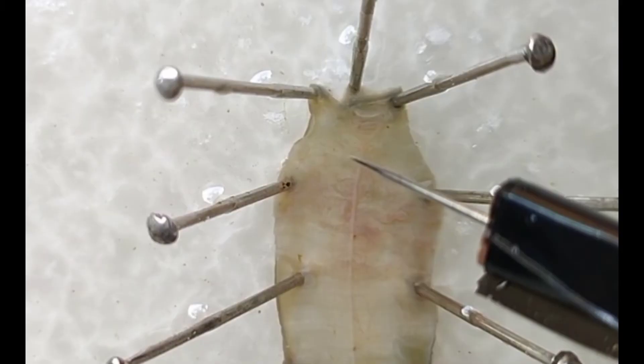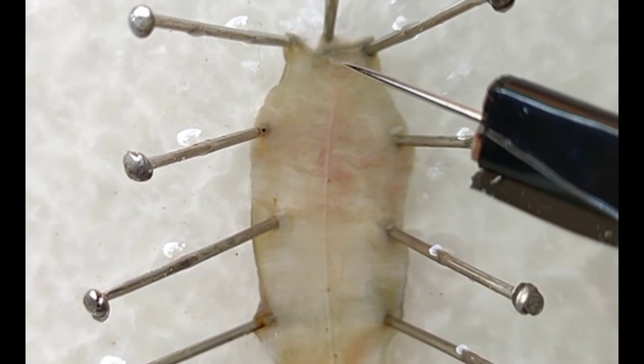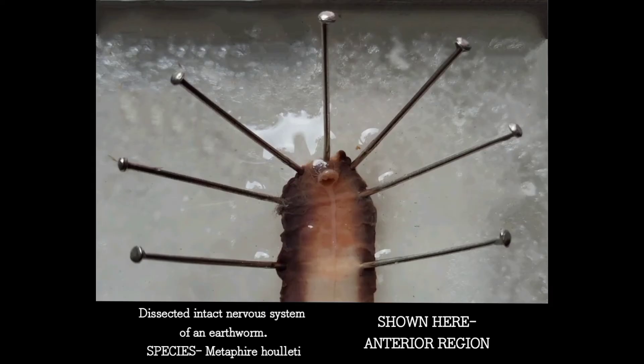In this magnified view, this is the nerve ring and this is the ventral nerve cord. This is the cerebral ganglion, this is the circumpharyngeal connective, this is the subpharyngeal ganglion, and this is the segmental ganglion.